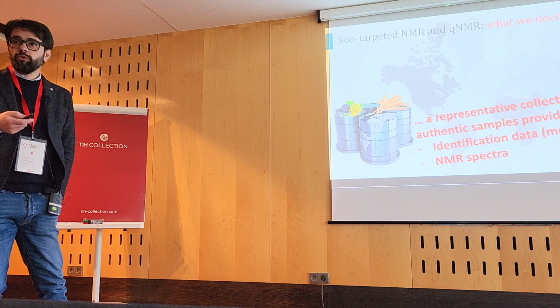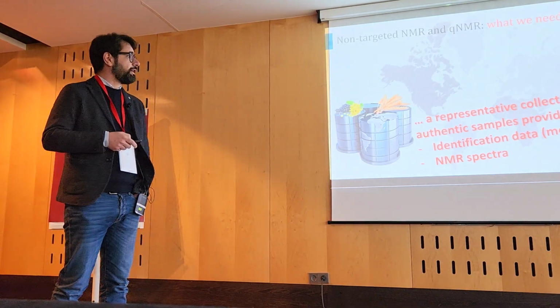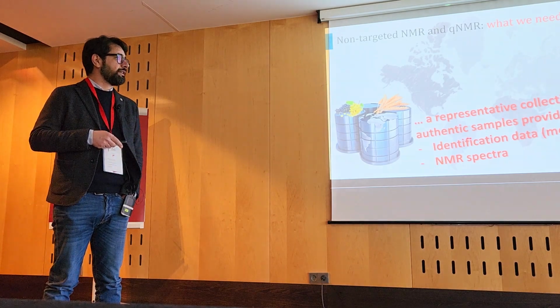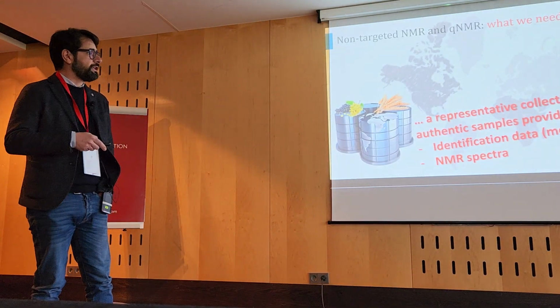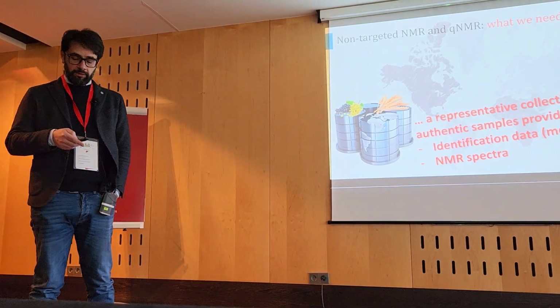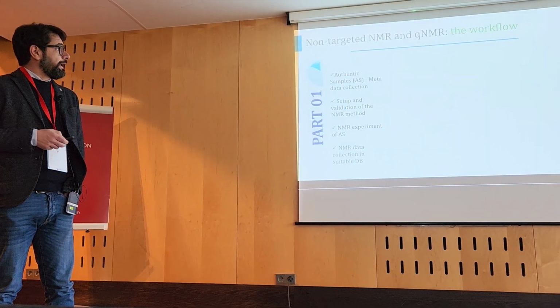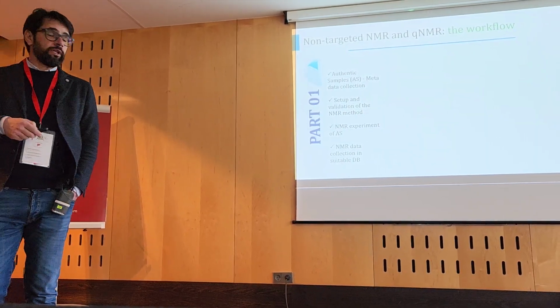What we need to answer these questions is a representative collection of authentic samples, provided with identification data, the so-called metadata, and NMR spectra related to these samples. And how does it work?